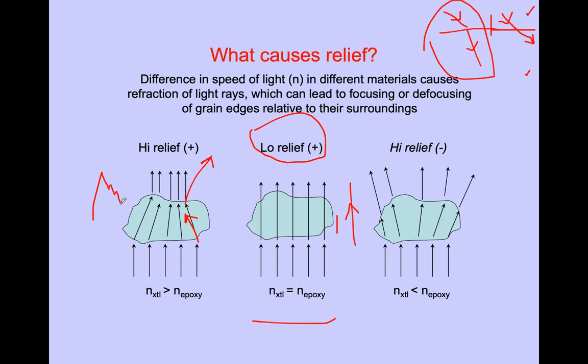And in some cases, you can have the opposite situation also. That is not a common situation. There are epoxies having very large, I mean, this difference should be very large in that situation. But here, to give a very high relief, this difference must be very big, right? Otherwise, it will give you some small relief. If it is very large, then you will have a large relief difference. Otherwise, some small relief difference, like that, right? It depends on the relative difference anyway.